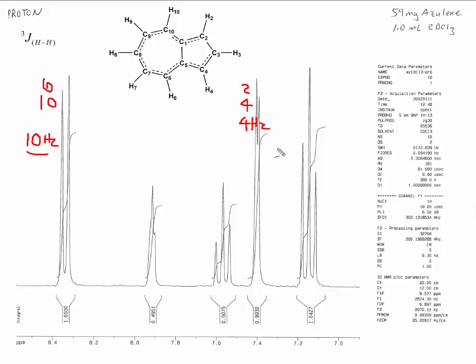So a Gaussian calculation can confirm that the doublet that is a little bit wider here is the 6,10, and the one that's more narrow is the 2,4. Moving on to the triplets now. If you weren't aware of the whole idea of the magnitude of J, pause the video and check your work. See if you can assign the triplets properly.